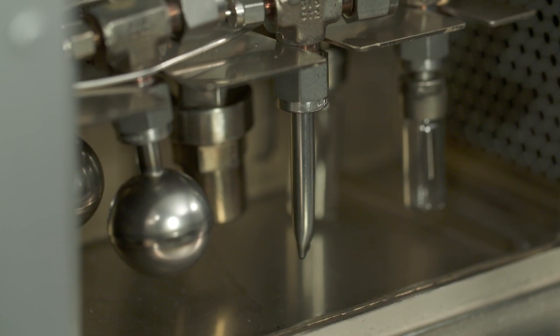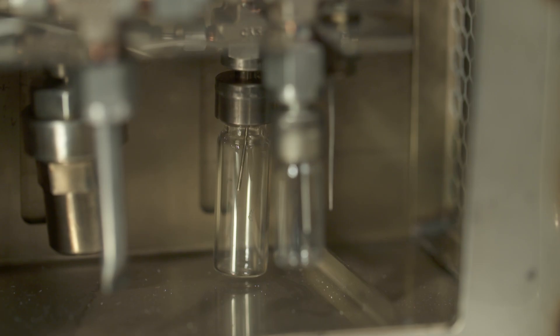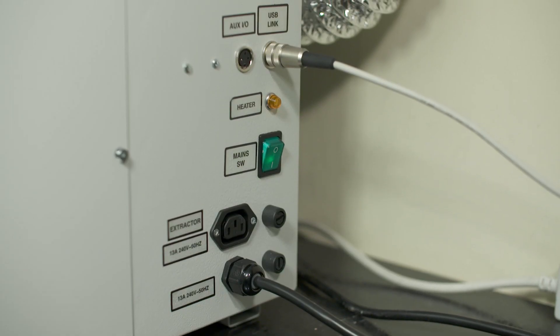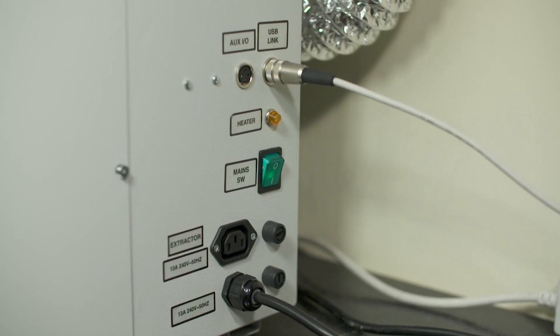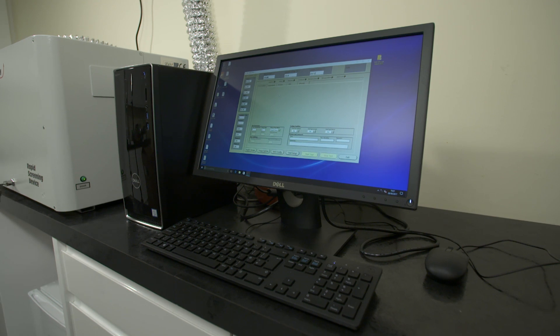The RSD allows the use of a wide variety of sample holders demonstrating its versatility. Control of the instrument is via a USB connection to a desktop or laptop computer.